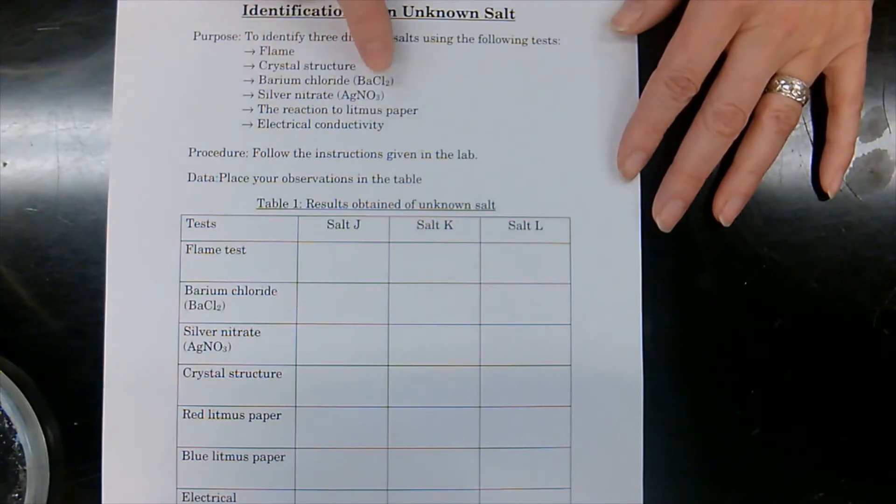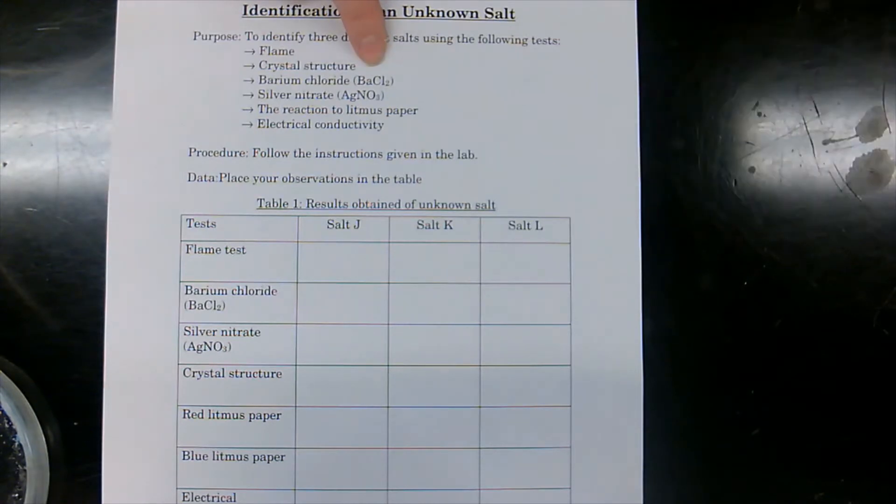The barium chloride, what it's going to do is that we're going to see if it creates a precipitate. If it creates a precipitate, that means that the ion, one of the two parts of the salt, actually has a sulfate in it.